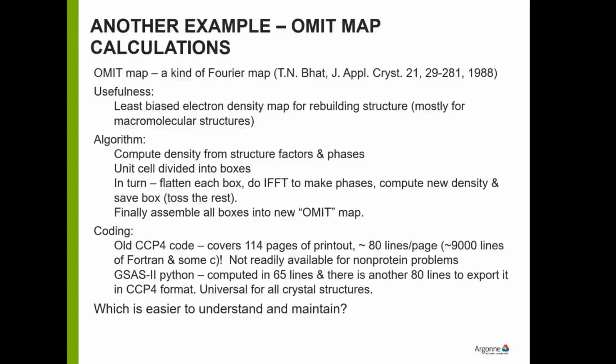And it's the least biased electron density map that you can produce. Because what's in there doesn't depend on what's in there, it depends on what's around it.